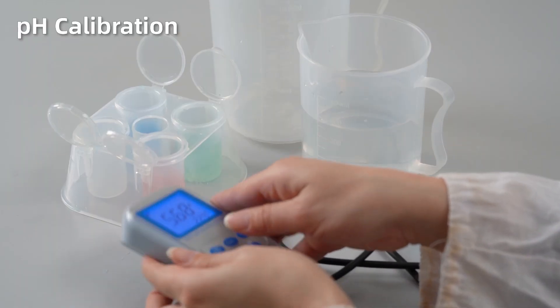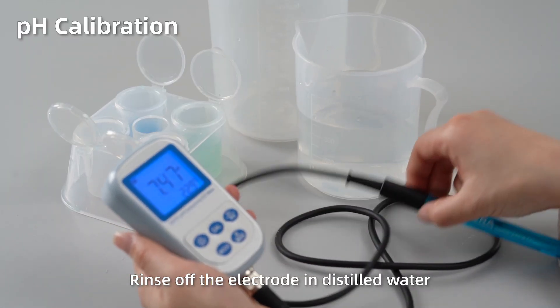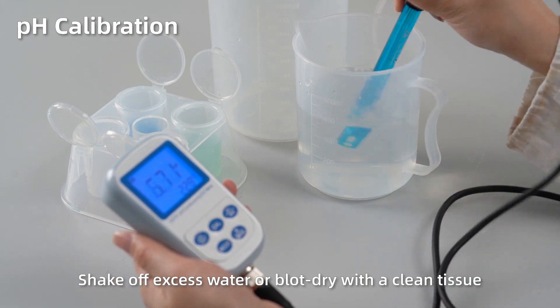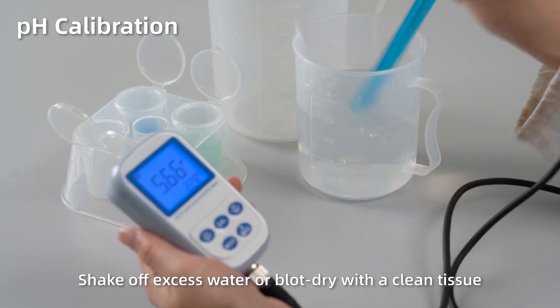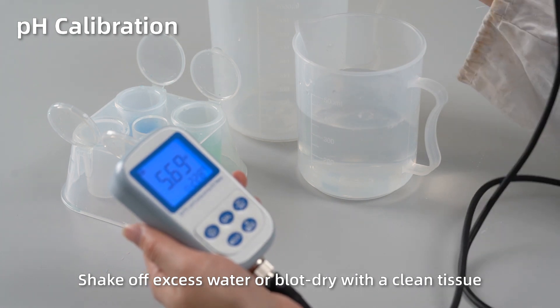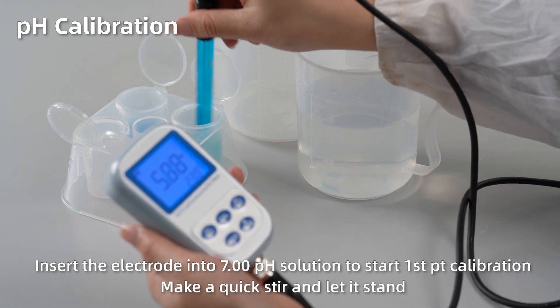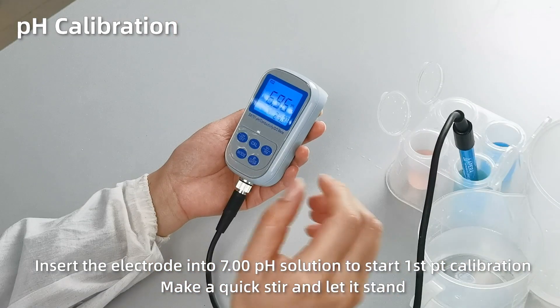pH calibration. Rinse off the electrode in distilled water. Shake off excess water or blot dry with a clean tissue. Insert the electrode into pH 7 solution. Make a quick stir and let it stand.